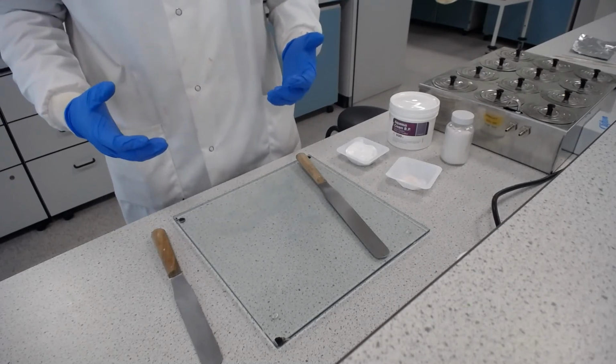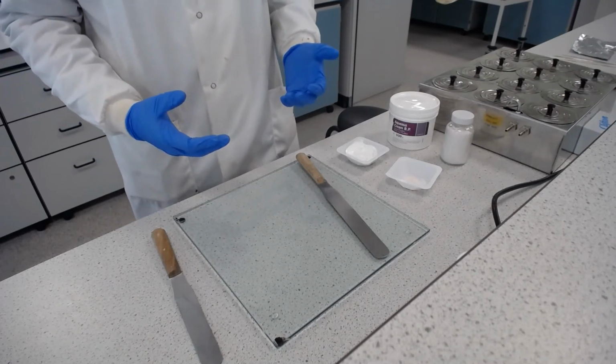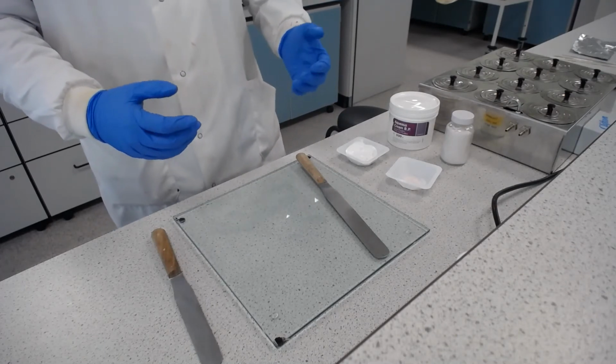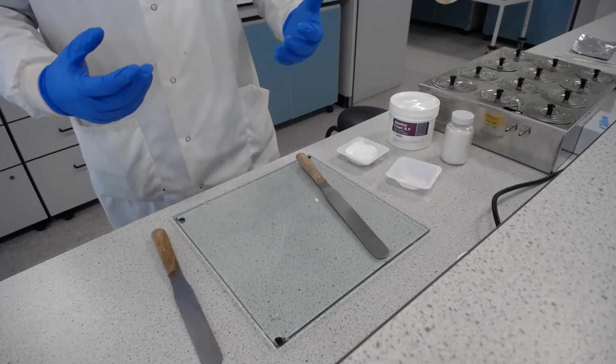Only a small amount of base is used initially to make a paste, and this is a common theme in lots of things that we make. We might make an admixture or a paste to begin with so that we can get that grain size down and we can get rid of any lumps.